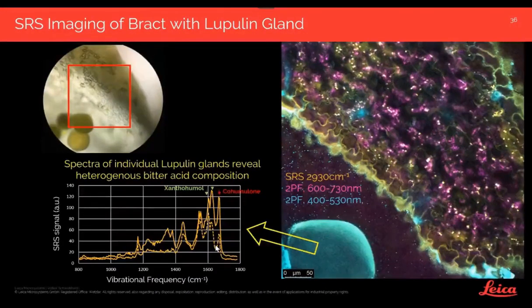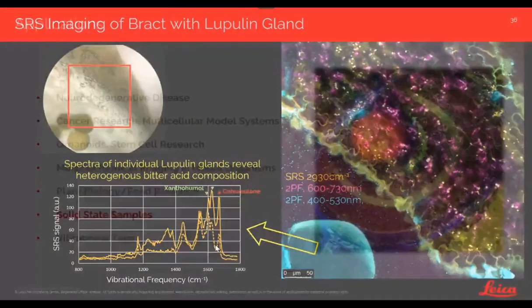And so this, in our opinion, will be able to help with analyzing food samples for their degree of freshness, maturation, for their storability, for their durability. So a whole range of applications in food quality and optimizing food production.